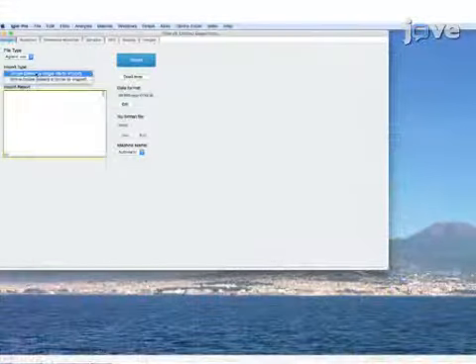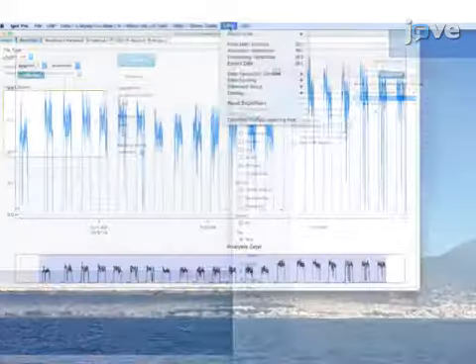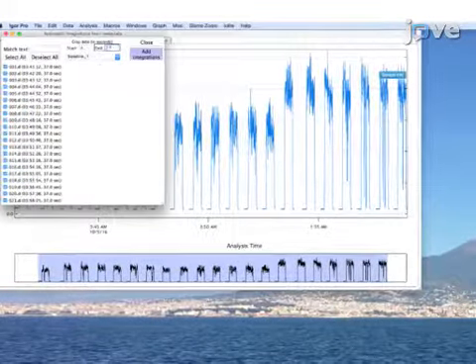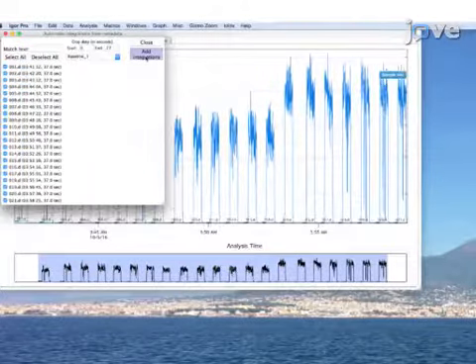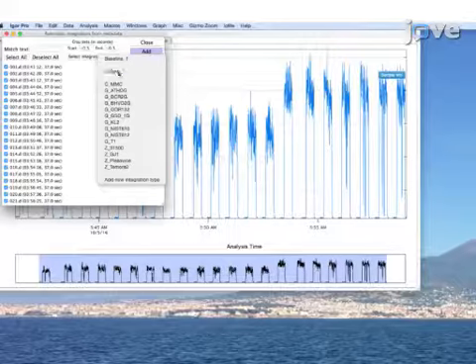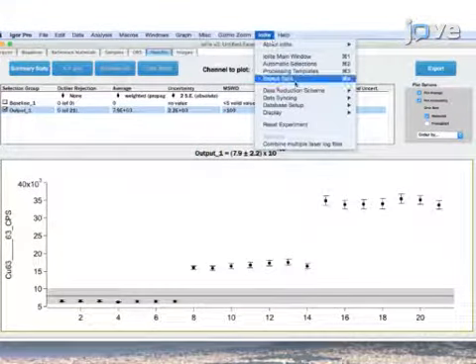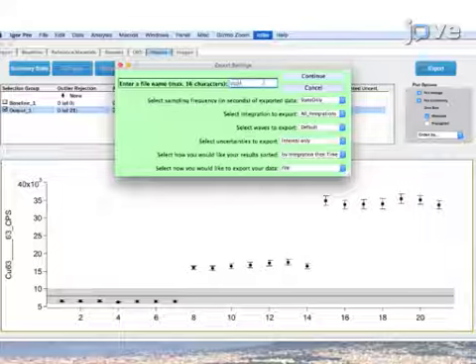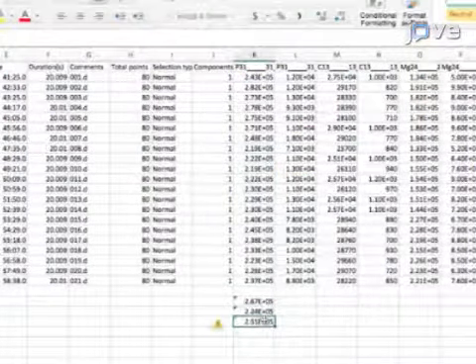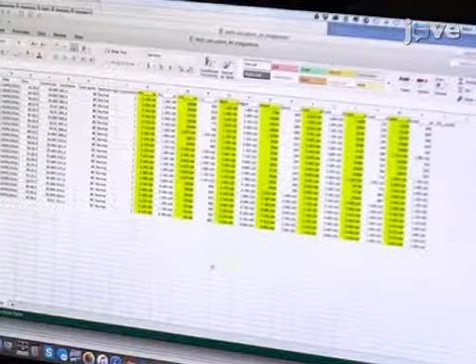Once the data has been collected, extract the data for the standards from the CSV files. Perform baseline subtraction and exclude the background signal. Identify signal drops caused by holes in the tissue standards. Mask these low signal areas, and then export the data as a spreadsheet. Calculate a conversion factor from CPS to ppm for each element identified. Repeat this process for each standard.